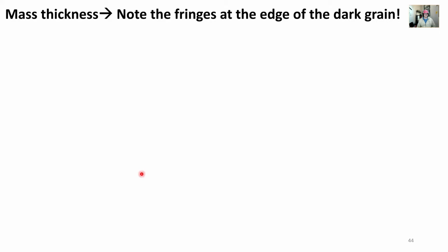Three main sources of contrast we're going to talk about today. Mass thickness, and I don't know why I bothered putting an animation here. I'm sorry.